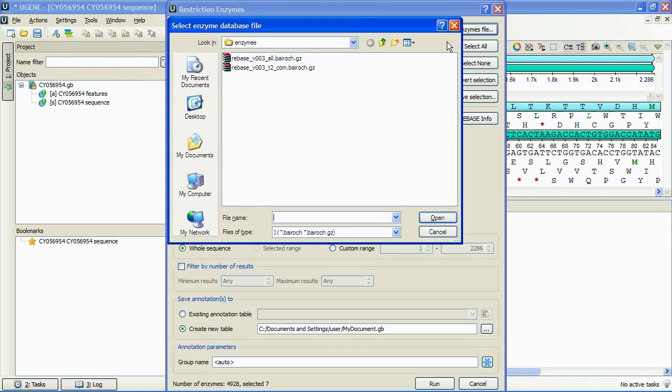Eugene distributives contain two recent enzyme database files, the full and T2 versions of REBASE-based database. We choose the full one.